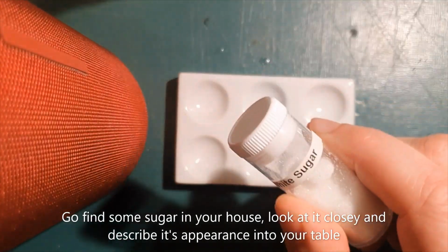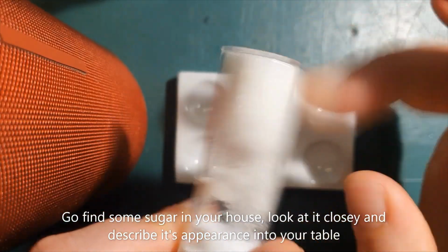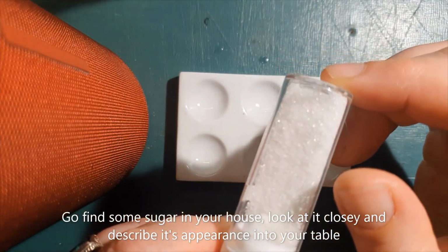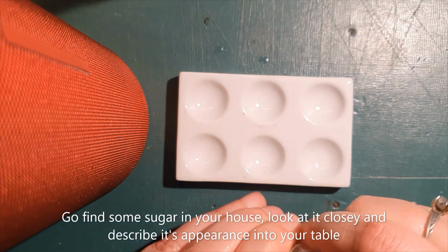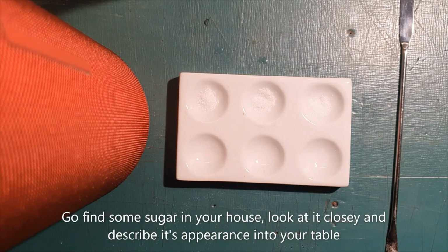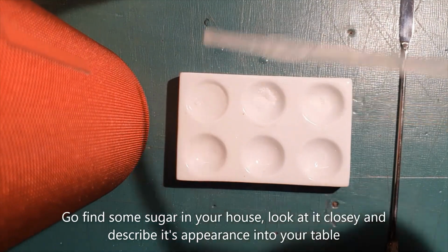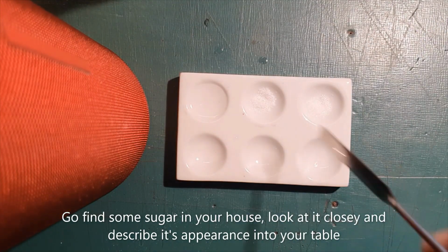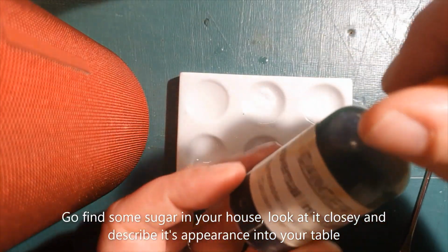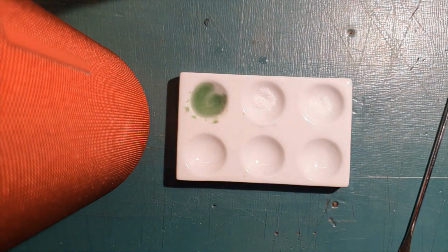All right. So the first thing you want to do is go look at some sugar in your house. I'm assuming you have sugar in your house. What's the texture, appearance? Fill that out. And then we'll get to testing. Let's do sugar. Ta-da! Okay. Let's dissolve some in some water. Universal indicator. Let's test the pH. I love how it dissolves.